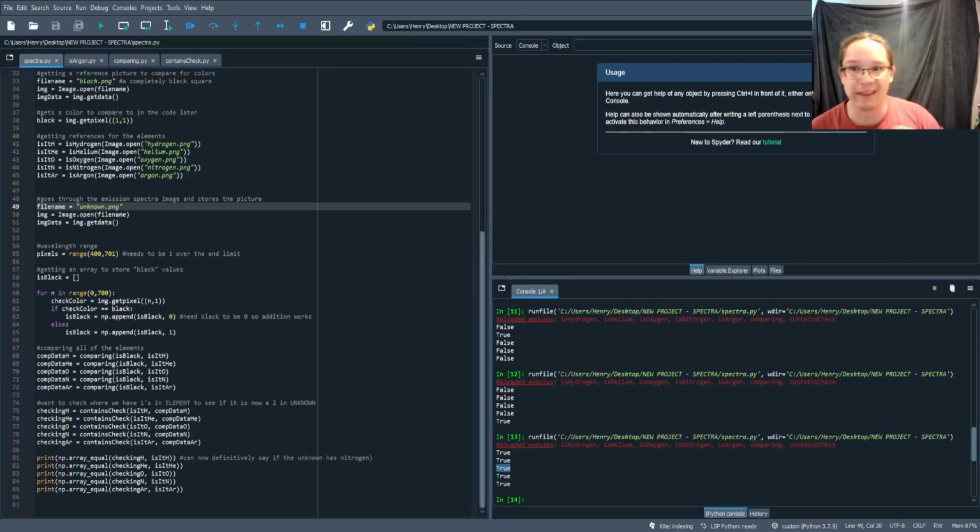So this was just a fun little project that I tinkered with for a bit, worked on more image processing. I want to figure out a way to do the image condensing in Python. I don't want to have to rely on Photopea or any other photo processing for that matter. The next step, I think, is finding a way to condense images in Python on its own. Don't know how to do that? That'll be the next step in the adventure.